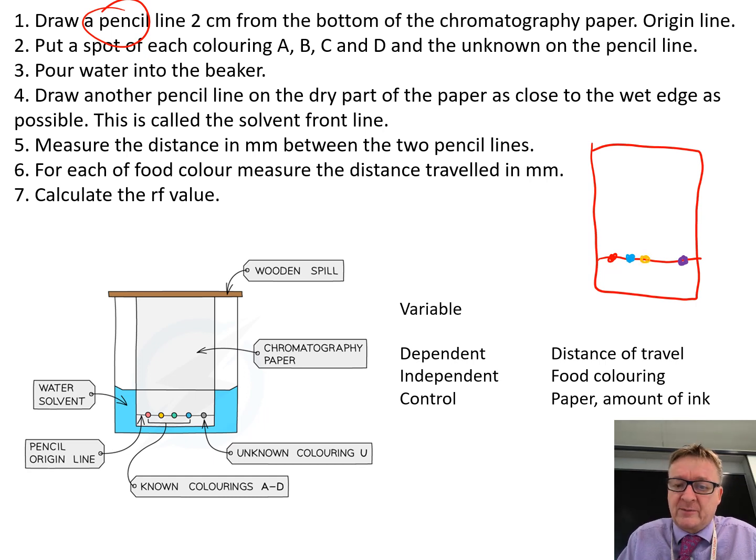Pour the water into the beaker. What you've got to do is make sure that the water doesn't, like on this diagram here, because this is not good.